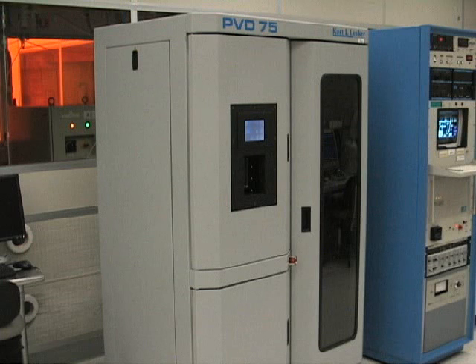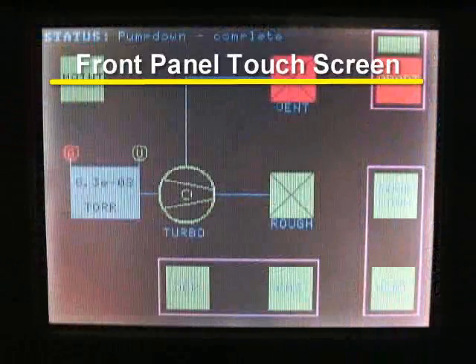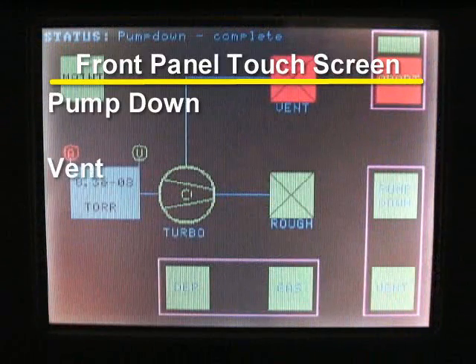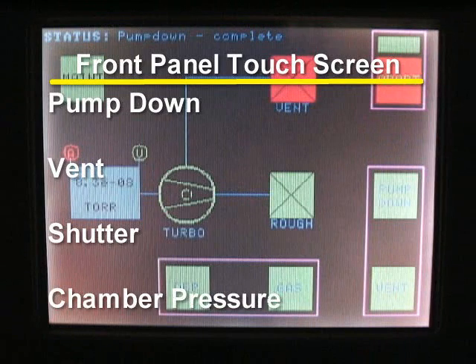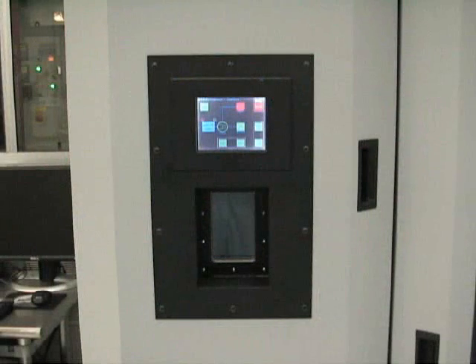The PVD-75 uses a turbo pump for a reduced pump down time. It is also equipped with a front panel touch screen which contains the pump down, vent, and shutter controls. It also displays the chamber pressure. The front panel touch screen is located directly above the chamber viewing window.